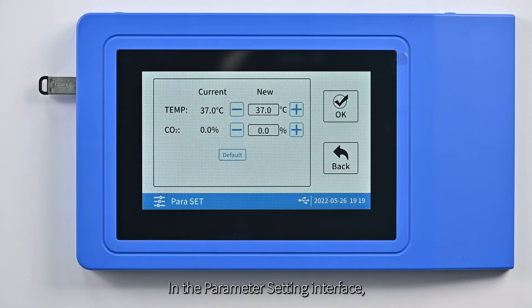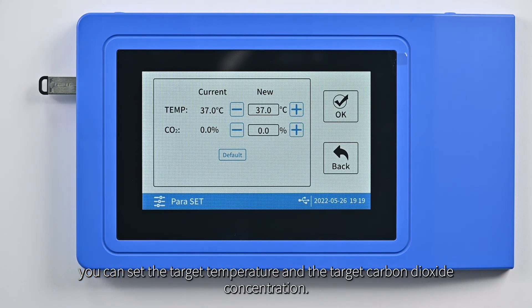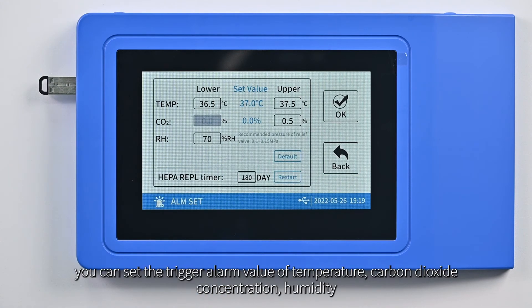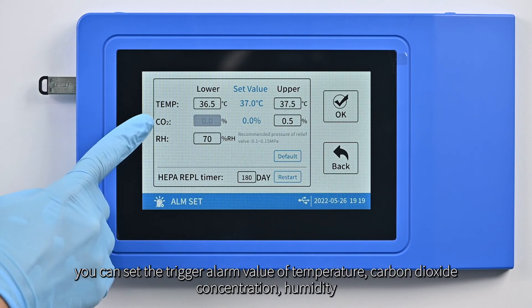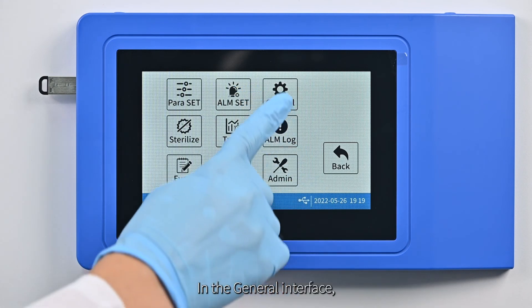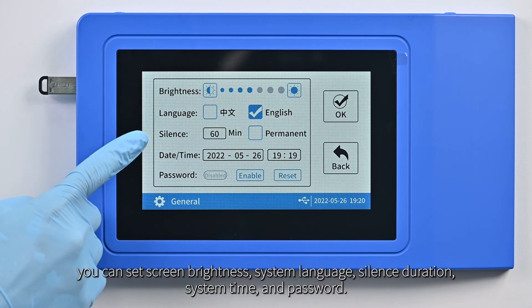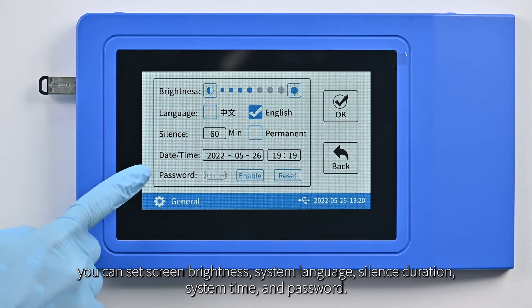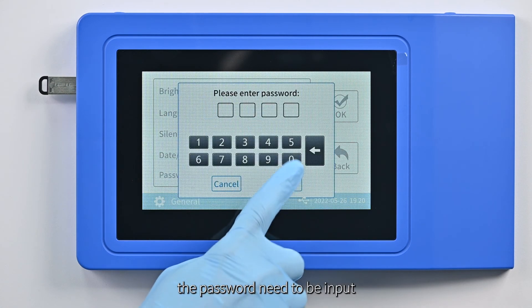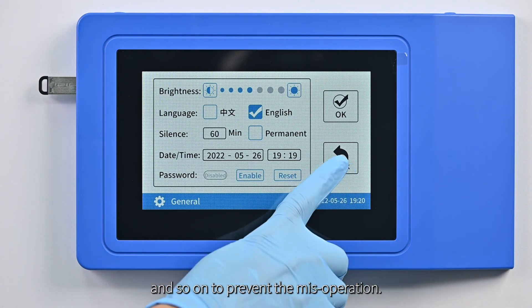The menu interface includes the following functions. In the parameter setting interface, you can set the target temperature and the target carbon dioxide concentration. In the alarm setting interface, you can set the trigger alarm value of temperature, carbon dioxide concentration, humidity, and the countdown for pepper filter replacement. In the general interface, you can set screen brightness, system language, silence duration, system time, and password. After the password is enabled, the password needs to be input to enter the parameter setting and alarm setting pages to prevent mis-operation.